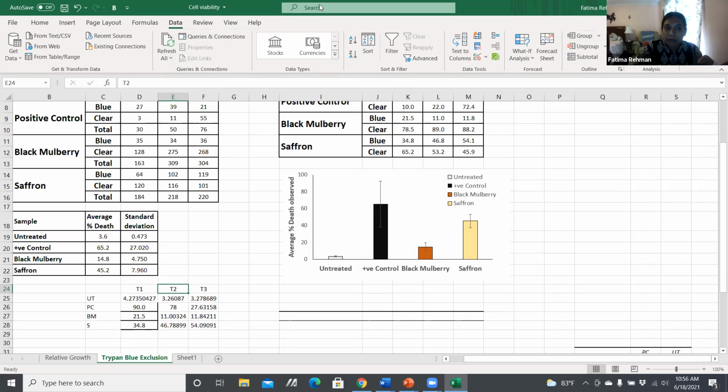If you are a Mac user, it is one of the icons on the top. I think it's Tools or Analysis, one or the other, that you go to, and then you still go to the same thing. You go through Options, and then the same process happens. But just to get to that Options tab, you can't go through File. It's through one of the other bars up there. Okay.